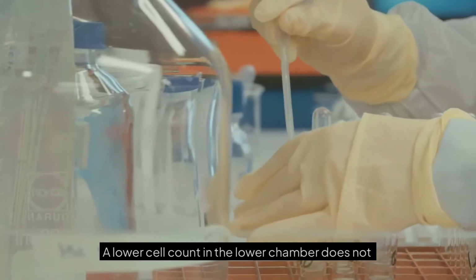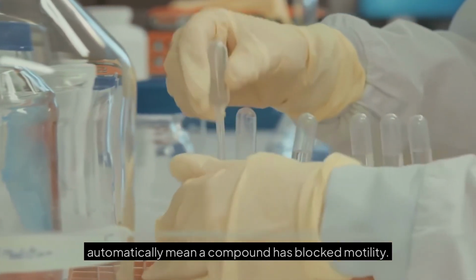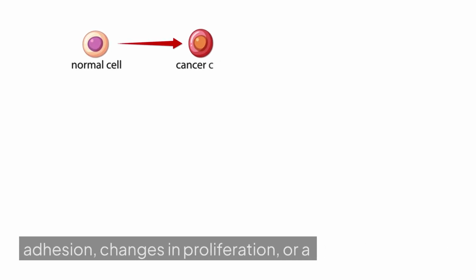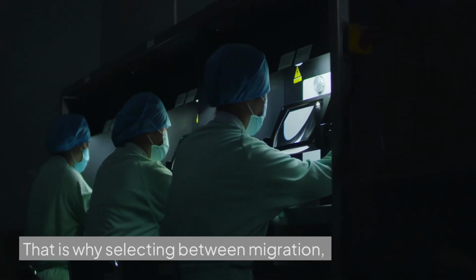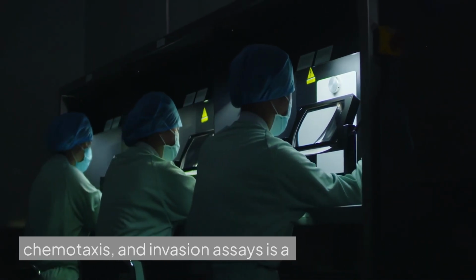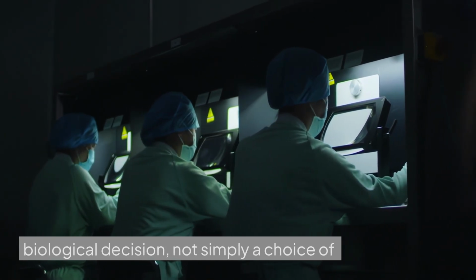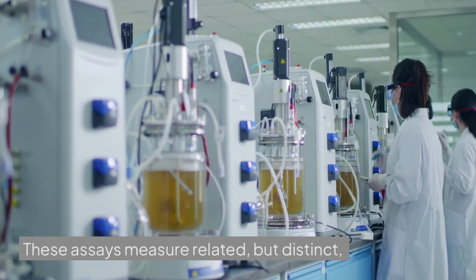A lower cell count in the lower chamber does not automatically mean a compound has blocked motility. It may reflect reduced viability, altered adhesion, changes in proliferation, or a poorly controlled assay condition. That is why selecting between migration, chemotaxis, and invasion assays is a biological decision, not simply a choice of laboratory format. These assays measure related but distinct questions.